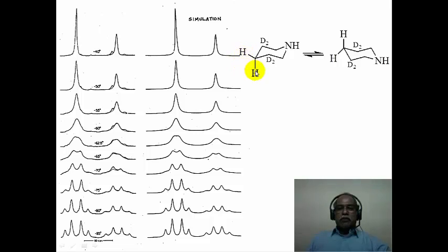So this AB quartet, which is the 4 position, away from the nitrogen, has a lower chemical shift value, whereas the one that is adjacent to the nitrogen has a higher chemical shift value, which is this particular AB quartet. So you see two AB quartets corresponding to the diastereotopic methylene protons in a frozen state, where there is no rapid chair to chair interconversion between the two states.